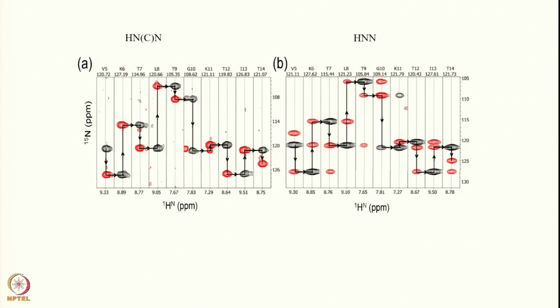So this is therefore extremely useful for obtaining rapid assignments in proteins regardless of the size, especially in intrinsically disordered proteins where there are flexible domains, and it is very difficult to obtain assignments without this sort of a dispersion. So N15 dispersion is always good, so you can get resonance assignments in a rapid manner and in an unambiguous manner.